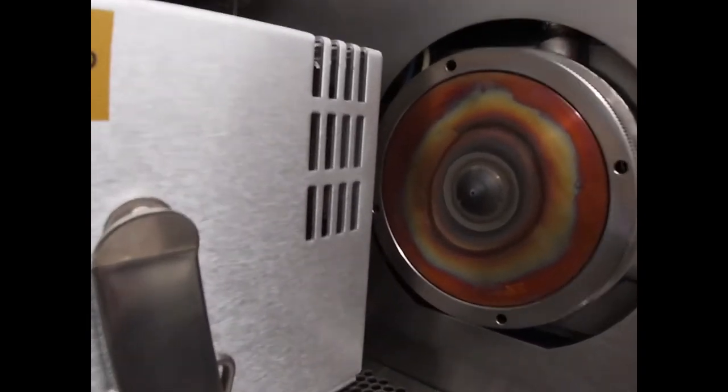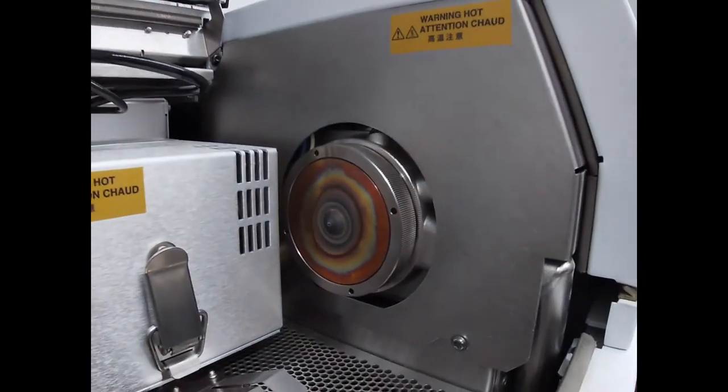So here I've actually pushed our torch box back out of the way so you can actually see the sampler cone. This is the outer sampler cone. The ions actually enter that little hole right there where they vacuum. And then separate inside that sampler cone is a skimmer cone that's even finer-tipped. And that's where it actually enters the high vacuum of the quadrupole.